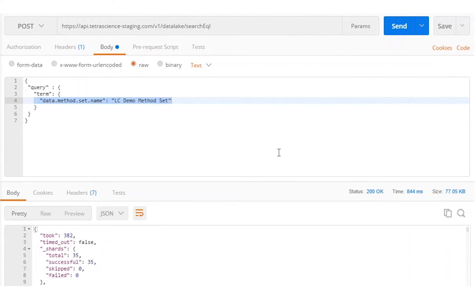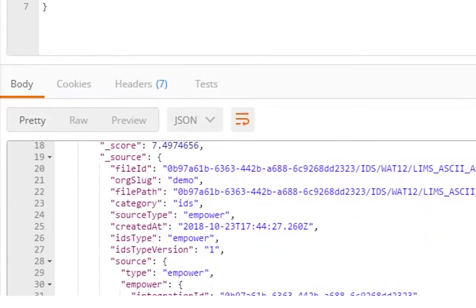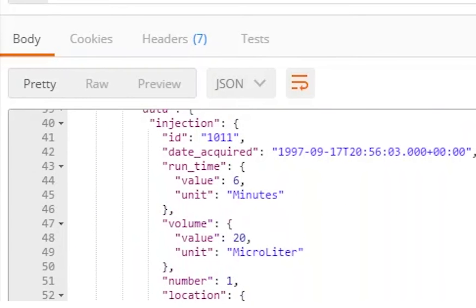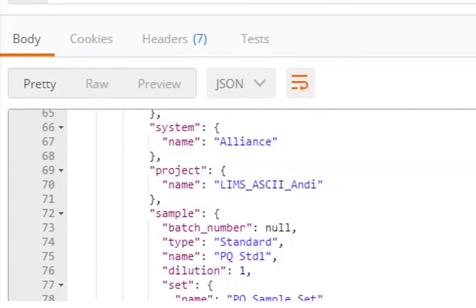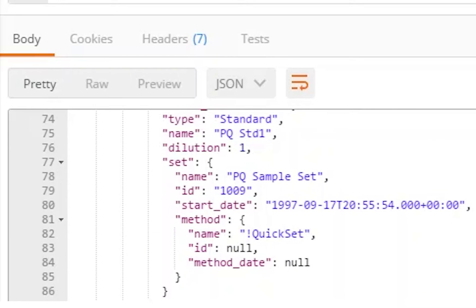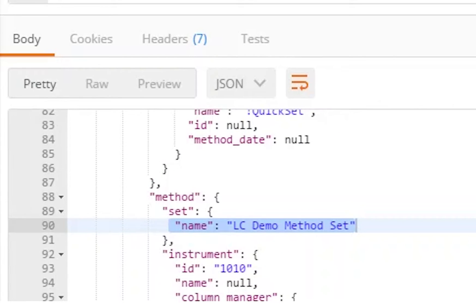This is a simple search using sample set name as a parameter. We can build more powerful searches like the example here, where we look for an injection that was acquired between a range of dates.